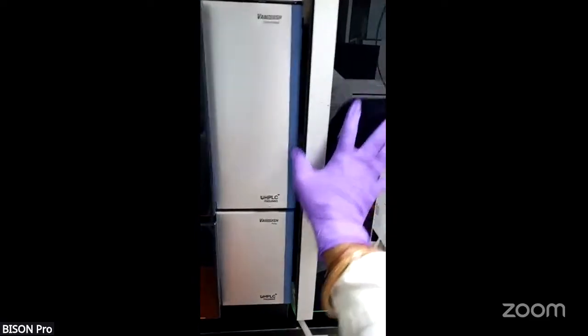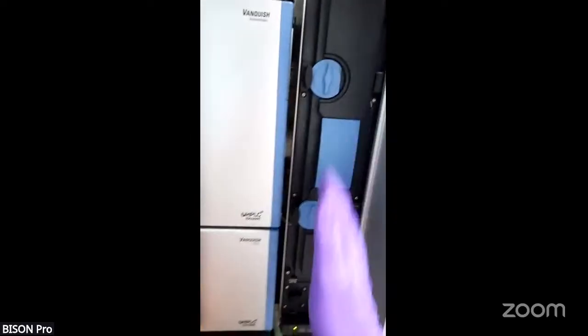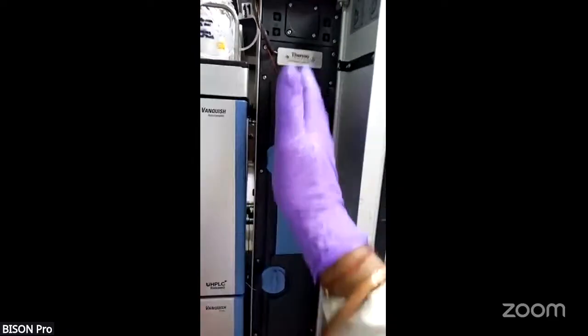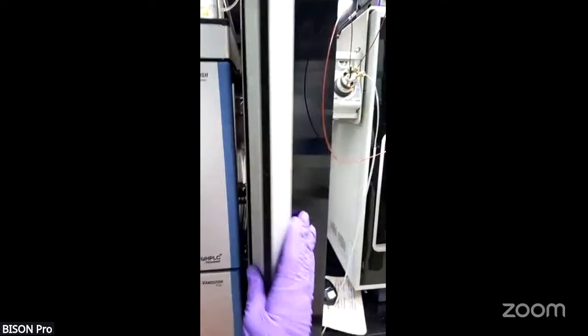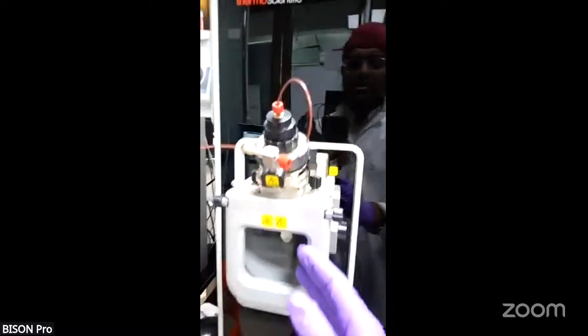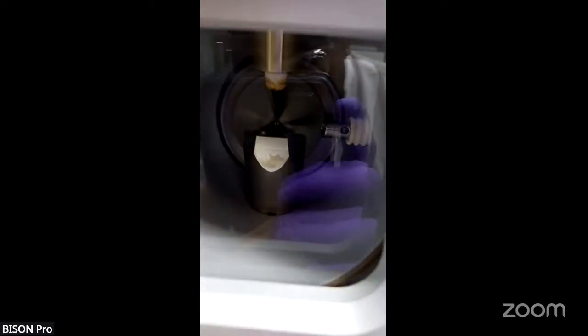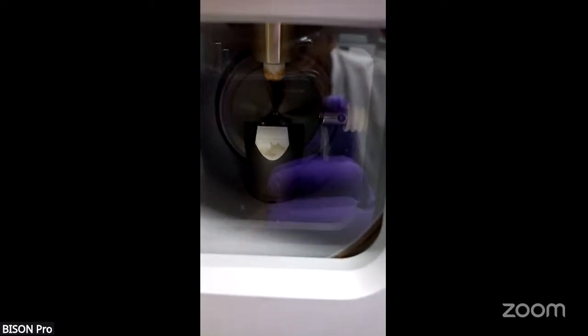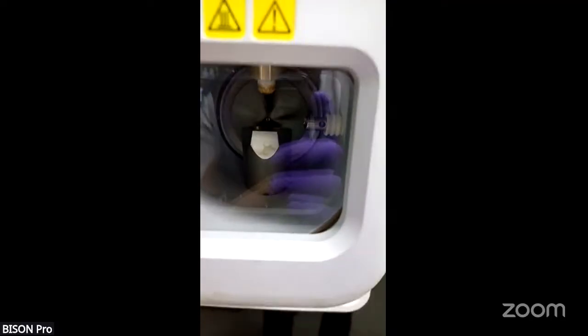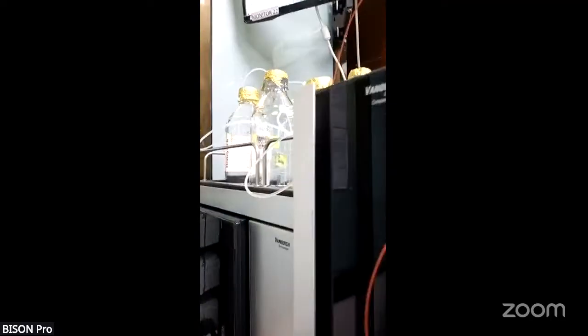and it travels through the HPLC column. You can easily find this as the column compartment. Once the samples are injected into the HPLC column, it again comes to the HESI source. This is how the HESI source compartment looks like, and from the HESI source we inject the samples and they go into the mass spec. So this is how a chromatogram.